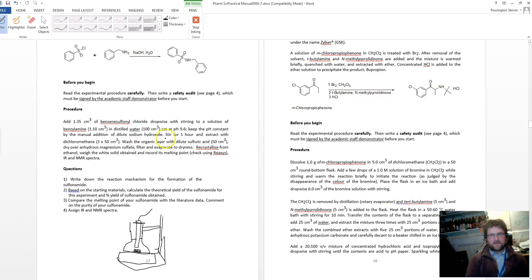Some of you commented that the pH was dropping over time. Well, that's the case. What are the byproducts of this reaction? Well, sodium hydroxide, benzylamine, HCl. One of the byproducts of this reaction should be the generation possibly of HCl. Some of the sulphonyl chloride being hydrolyzed, so HCl maybe should be generated in situ here. That should see a drop of pH. So that was something to comment on.